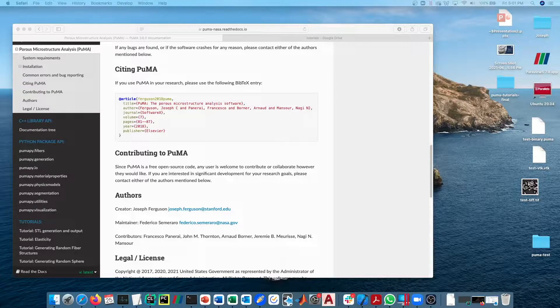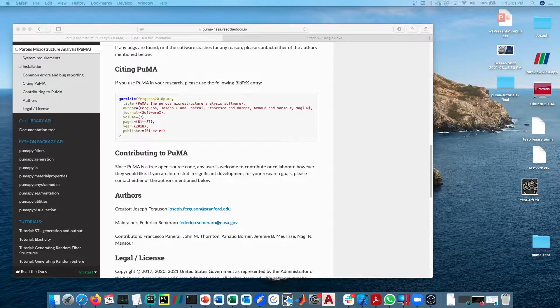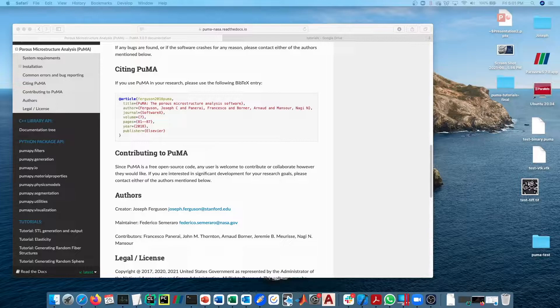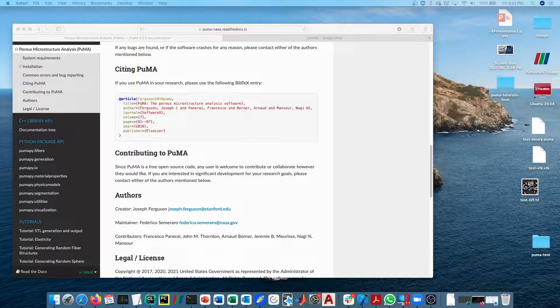This tutorial video will go through how to calculate the continuum tortuosity value for a given material. There is also the ability to calculate rarefied tortuosity using a particle-based method. I will introduce the particle-based method but not discuss rarefied tortuosity in detail.